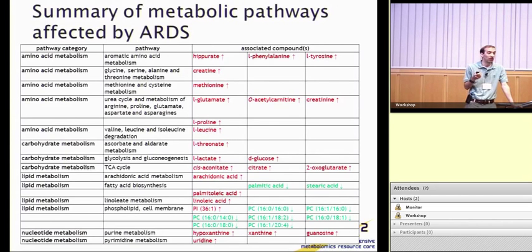What's causing these? Well, it could be a lot of features, right? It could be bacterial metabolism contributing to the content of the lung lavage fluid. It could be cell death and cell lysis, leaking some intracellular metabolites into the fluid. The lack of the surfactants may be indicative of the reduced ability of the lung to produce these useful surfactants to clear the bacterial contaminants that are present in lung infection and respiratory distress syndrome.